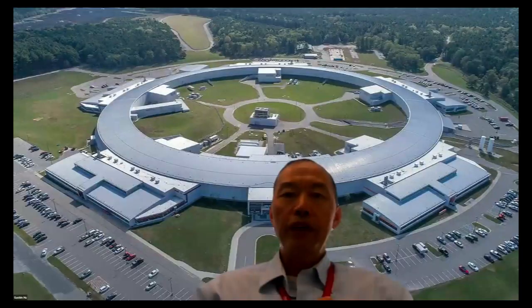So you think the single particle user's issue was global refine. We have done extensive tests. This is actually not a secret. A few very advanced users, like Kaijiang's group, always do this these days, even with the traditional pipeline. Once you're able to define the orientation of the particles, try not to do the global refine anymore. Focus on local refine. Normally you can get better resolution.